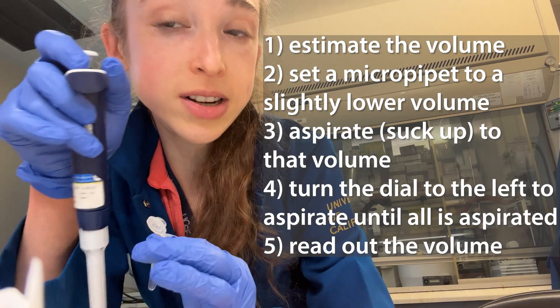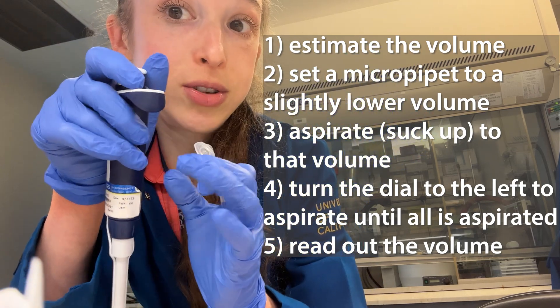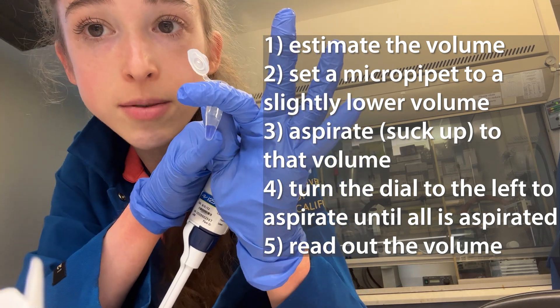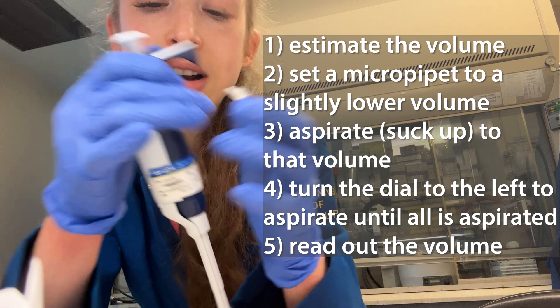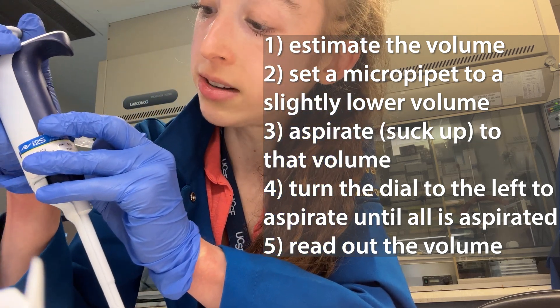Take an appropriate size pipette that's able to hold the volume you think is in the tube, and set the volume to slightly below that estimate. It looks like there's about 100 microliters in here based on the approximation line, so I'm going to set my pipette to 90 microliters.